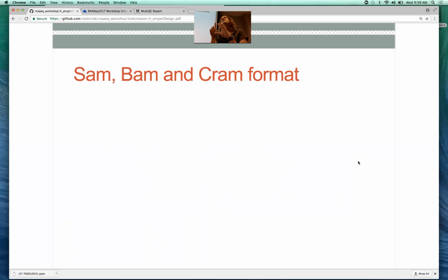If you run a HiSeq lane and expect 240 million reads, in single end mode you get 240 million single ends. In paired end, you get 240 million paired reads, so 480 million individual reads, because it's all about the cluster density on the slide. It doesn't matter how long that piece of DNA connected to the slide is.